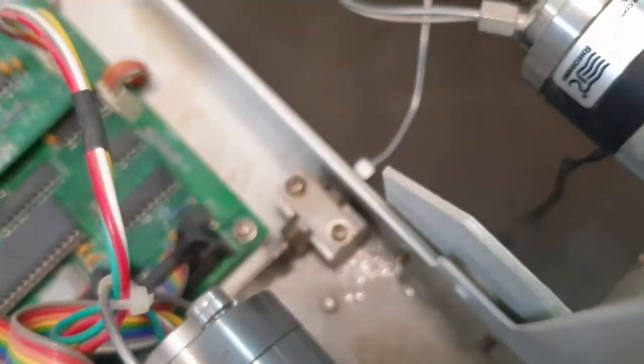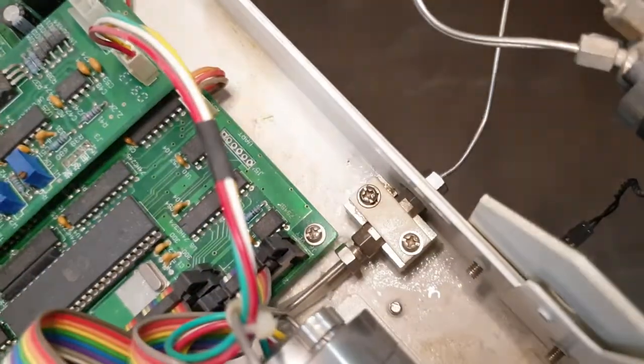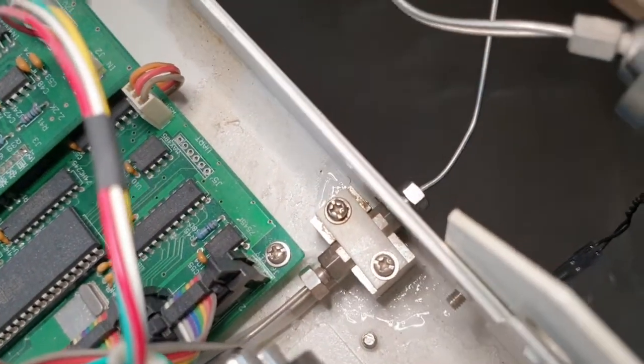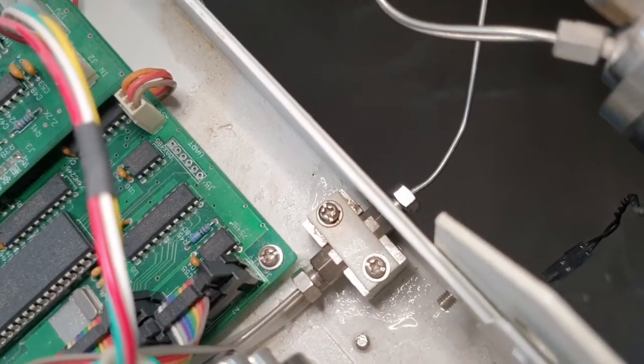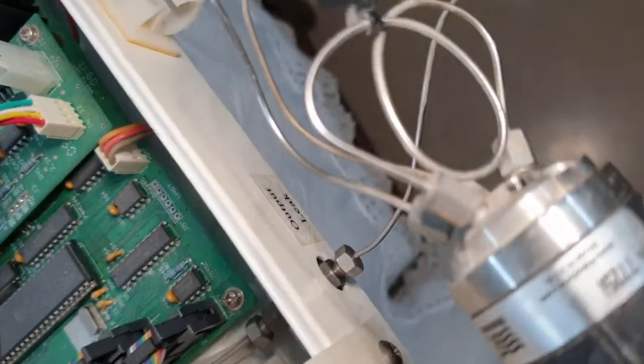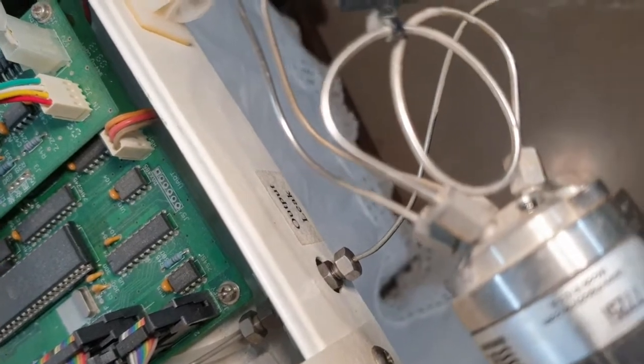As I told you earlier, there is leakage at this point. Here you can see the wet part of this pump, which shows that there is some leakage at this point and it is coming out from this drain pipe.